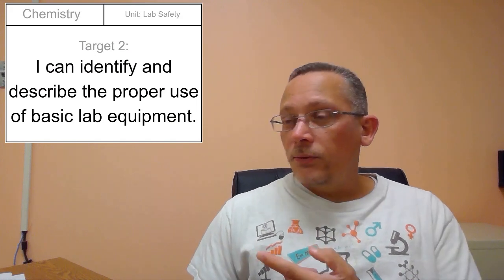In our last activity, we saw that a higher temperature leads to your sponge creature developing more quickly. We don't want the temperature of the water to affect this one. We just want the acidity to affect it, so we can see if the acidity affects how long it takes. And so today we're going to have the opportunity again to practice our lab safety, to be able to describe lab safety practices, and also have the opportunity to practice using the lab equipment again, so to be able to describe the use of some of the lab equipment. So let's take a look at some of that.